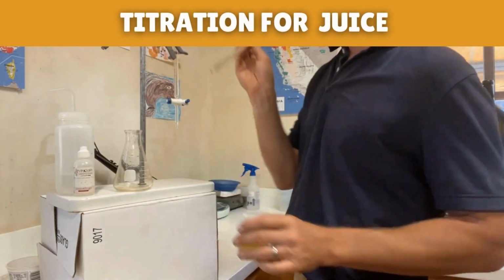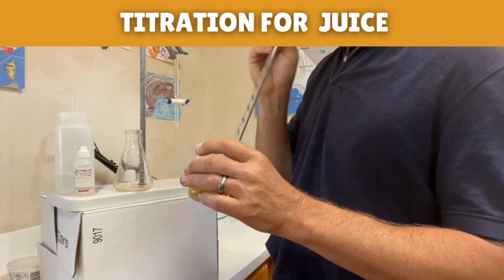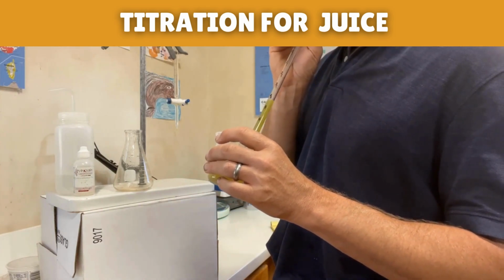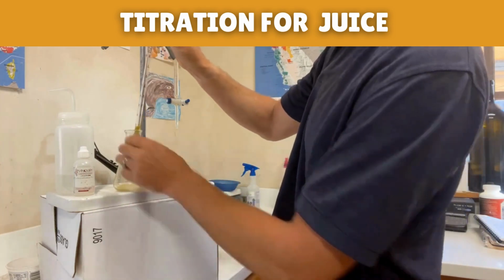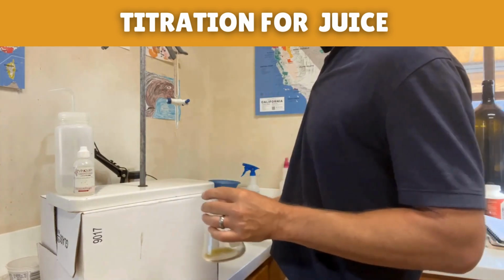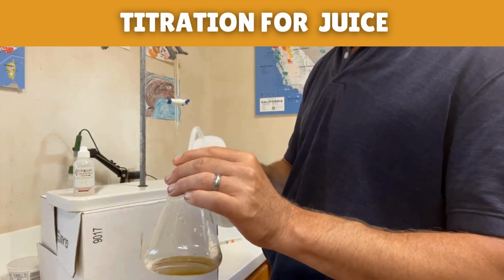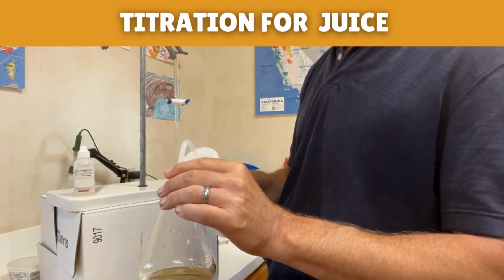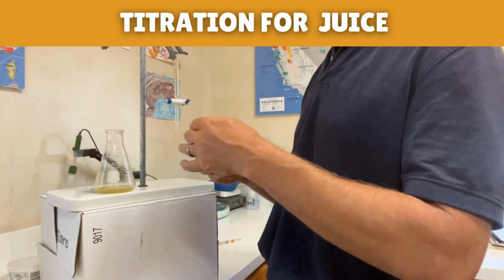Pipette, deliver 5 milliliters of juice sample into the flask. Then I'm going to add some water, again deionized, just to increase the volume of the sample here. It makes it easier to do this whole operation. A couple drops of this phenolphthalein indicator.